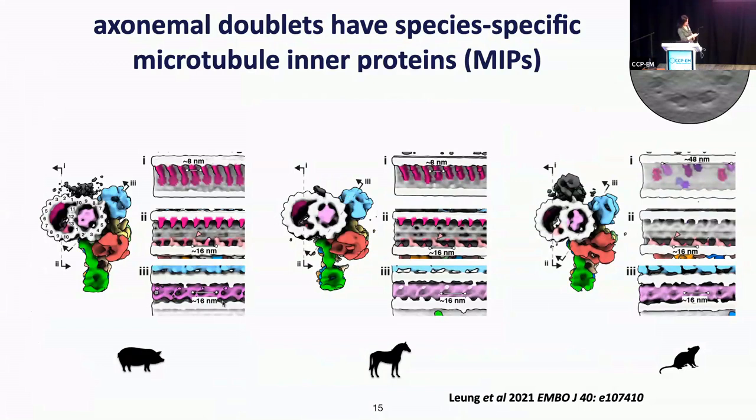Okay, gone. So we saw that there is a slight variation in terms of the microtubule inner proteins that are inside these microtubule doublets. But of course, as I said, what we wanted is to identify those proteins. So for that, we needed to be a bit more creative, or more correctly, the postdoc in the group, Miguel, was digging through all the literature and found that there is a way to gently disintegrate the whole axoneme structure.